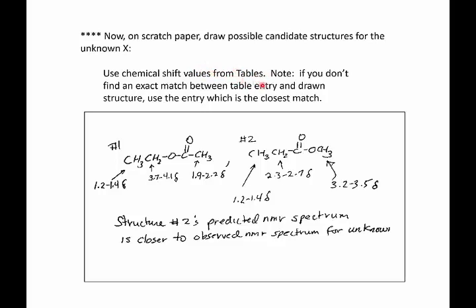And okay, so here you put all this together. I hope you can see that's not that hard. There are not that many possibilities. You've got to have an ethyl group, you've got to have a methyl, a C=O, and an oxygen, where there's not that many places to stick the oxygen. You can't stick it between the CH3 and CH2. You wouldn't have an ethyl group anymore.